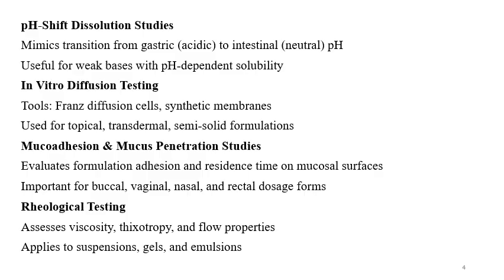Then in vitro diffusion testing. It is generally used for topical formulations. You can use tools and instruments like Franz diffusion cells to check the in vitro diffusion. You can use membranes like synthetic membranes, and generally it is used for topical, transdermal and semi-solid formulations to show the IVIVC, to show the equivalence.